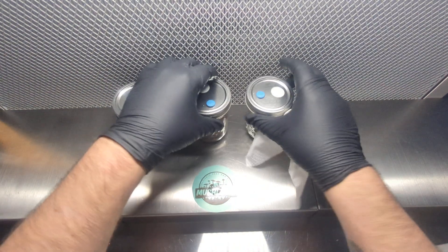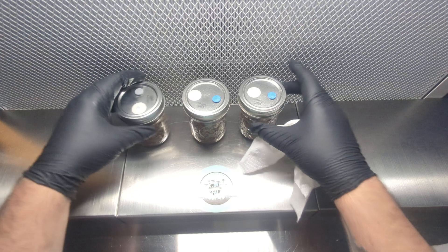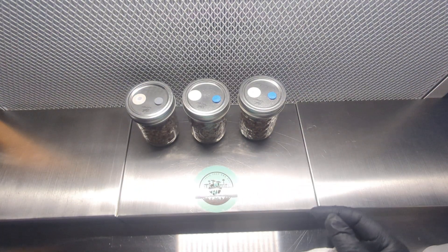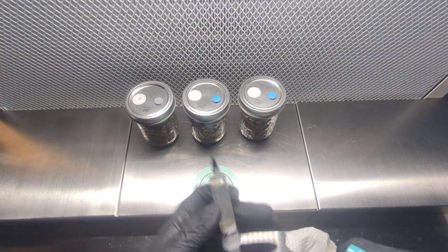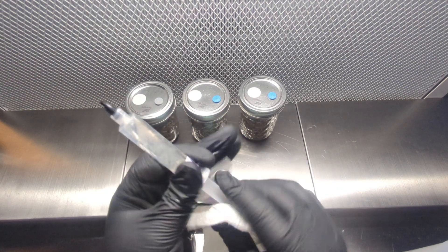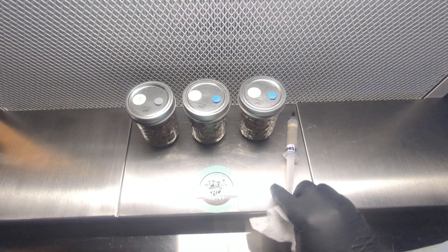I always like to have the injection port to the right of me since I'm right-handed — makes things a little bit easier. With the syringe, I'm going to give it a little spritz as well and wipe it down. Make sure to get in there good; you can't be too careful.